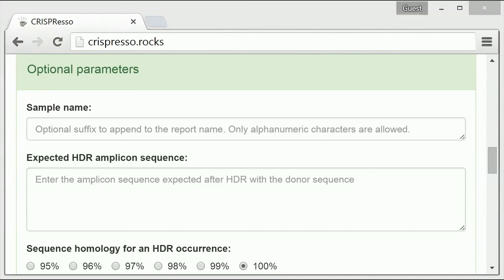The first option, under the sample name heading, allows for the addition of a suffix to appear on the file names of the output analysis files. As an example, we will enter the suffix test data.